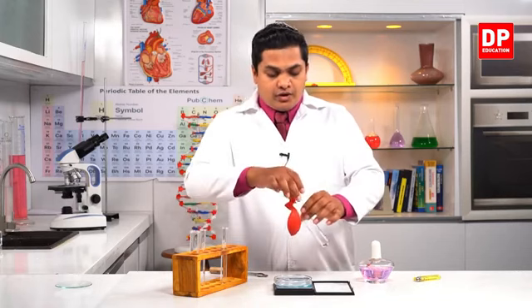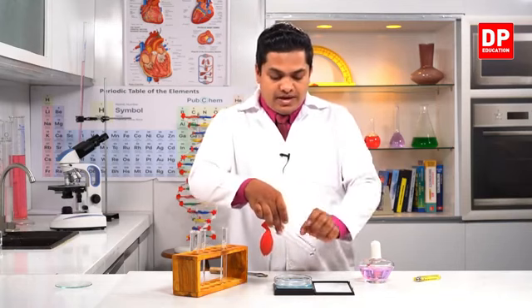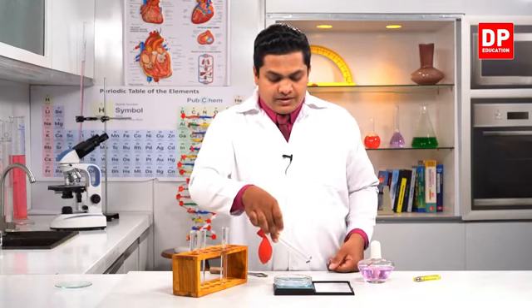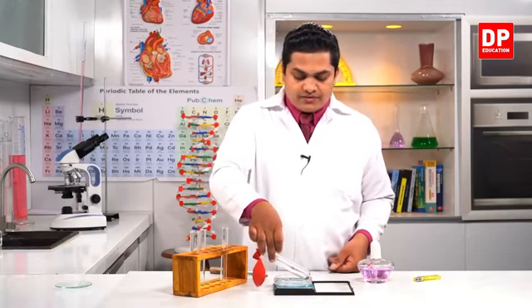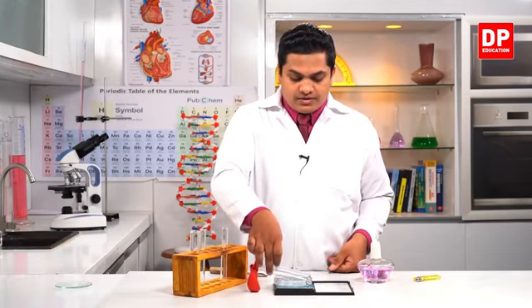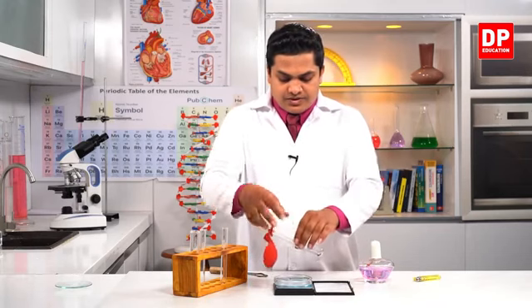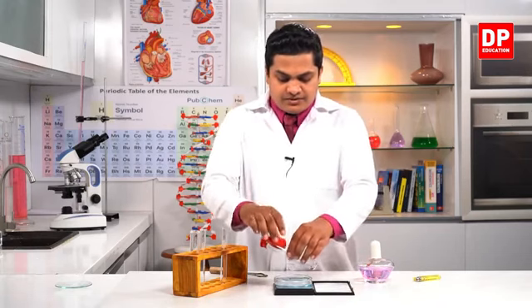So now I am going to place it on the balance, and let's measure the mass of the system.